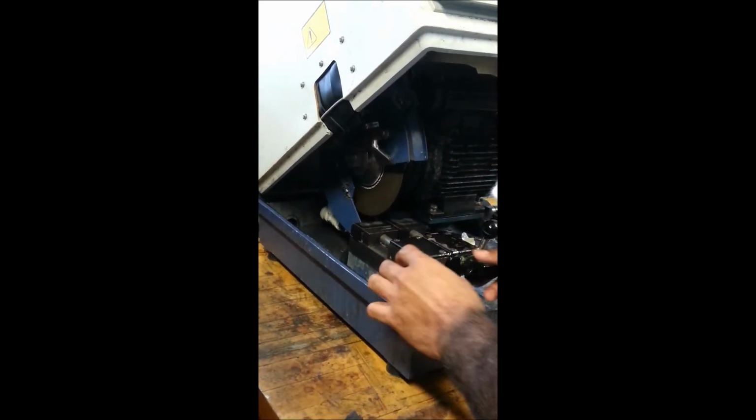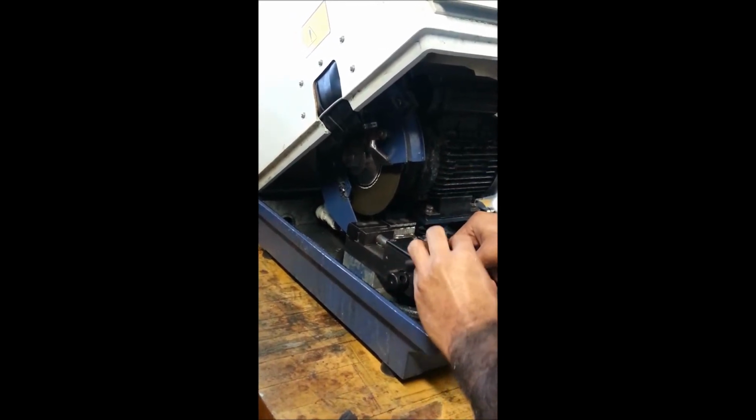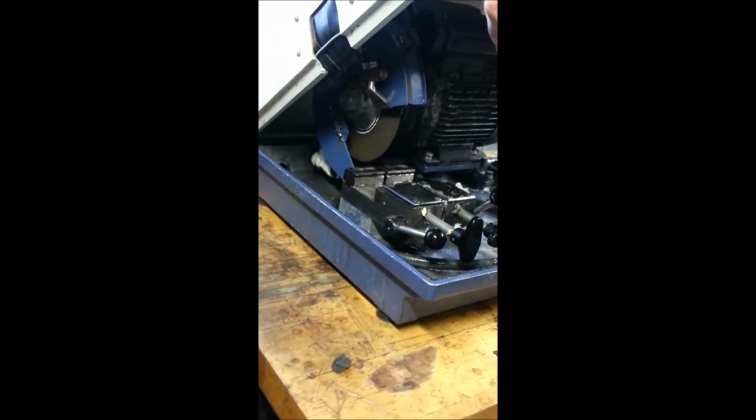Then we take out the sample and use it for our further process, which is heating the material with bakelite powder. If our cutting is very accurate, then we go on to our further process.